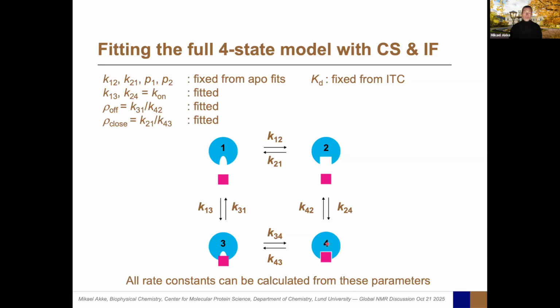So it is actually the case, if you look at all of these, the populations in the end, you actually have a subpopulation in the fully saturated state of state 3. So that's something we actually took into account when we used this KD and partitioned it out to the different states.